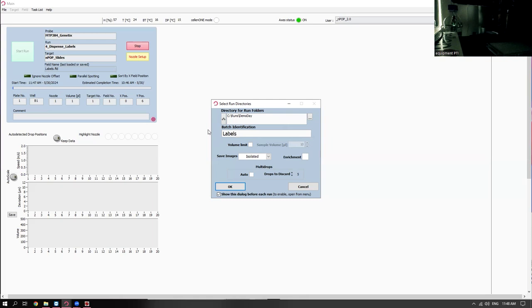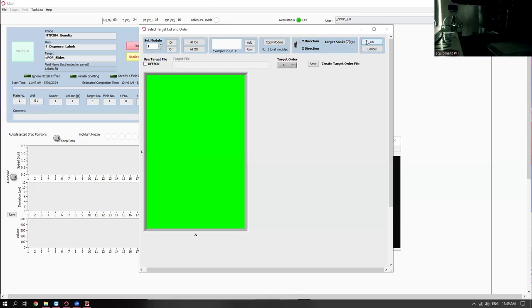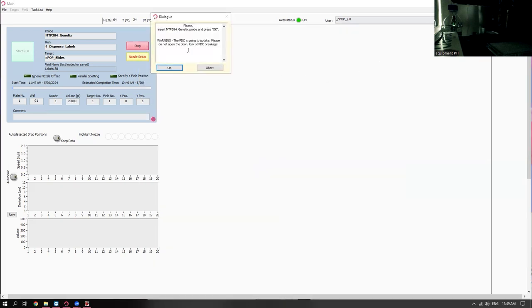There are certain kinds of substrates where we see droplets really lack off of the volume. But again, because of the full QC where we image everything, we would catch any volumes like that. You're not able to totally check the droplets before it goes to dispense, but you can manually check the droplet anytime during the dispense. So we're just going to make it go and upload it as we go.